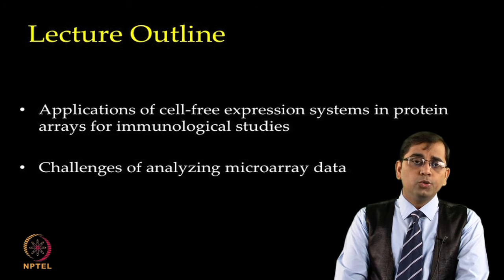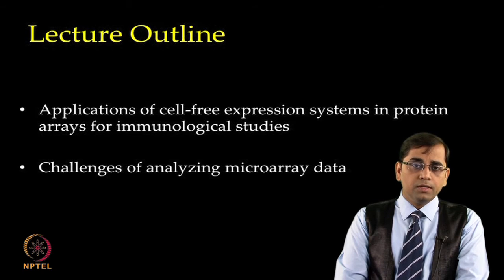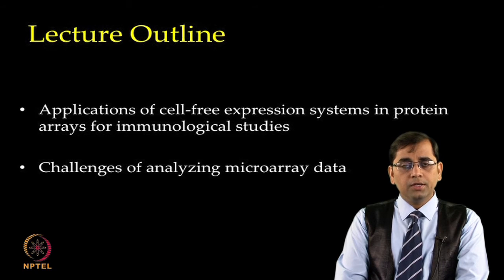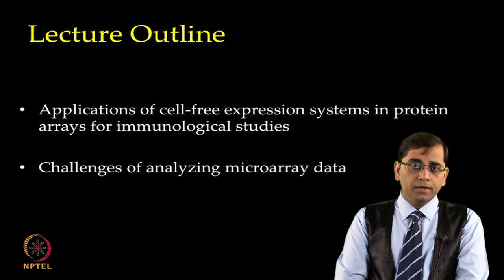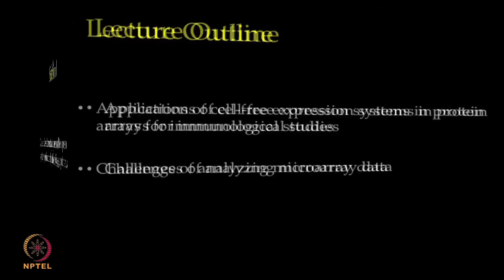Finally, we will also touch upon the challenges of analyzing microarray data, regardless of which experiments you perform and what biological questions you may want to address. However, the data analysis becomes very crucial and challenging in microarray experiments.